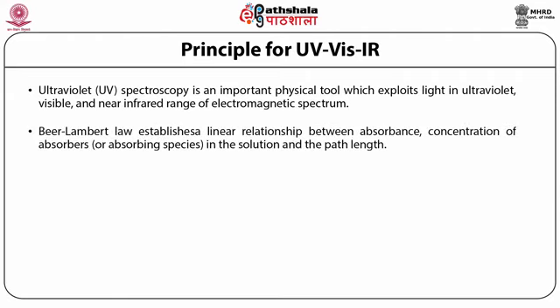The Beer-Lambert law establishes a linear relationship between the absorbance, the concentration of absorbing species in the solution, and the path length. Therefore, UV-Vis spectroscopy can be employed for determining the concentration of the absorbing species for a fixed path length.